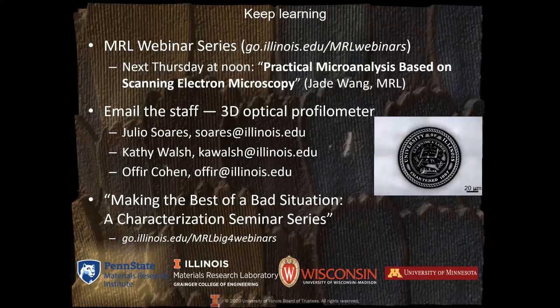Between the confocal and the focus variation, it's basically a question of speed that you would choose one over the other. Between confocal and interferometers, sometimes you want a resolution that goes way beyond what the confocal can do.